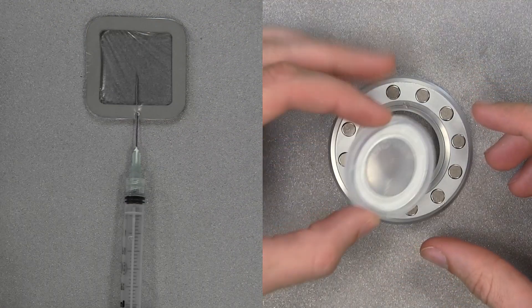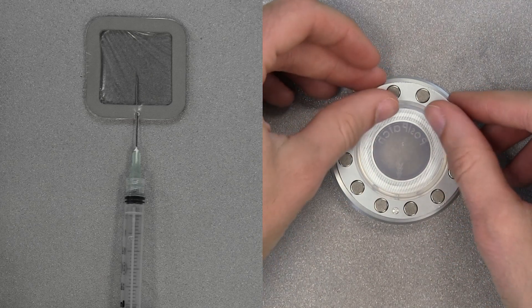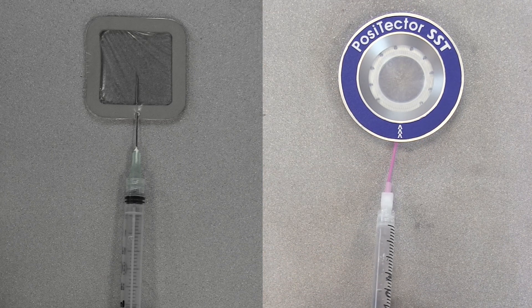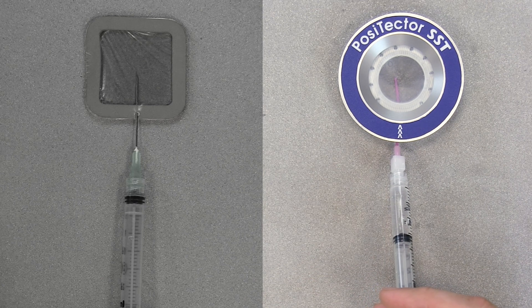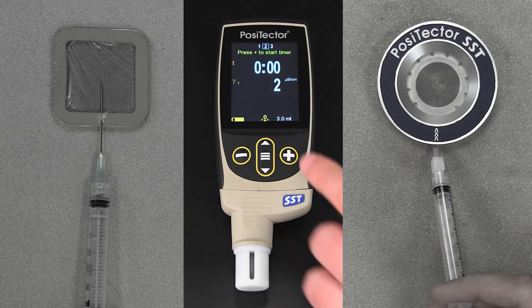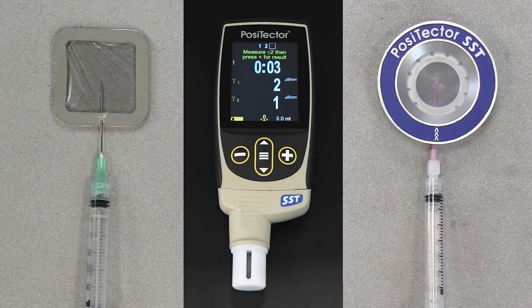If using the PosiPatch, begin by placing it into the magnetic ring, ensuring the arrows align with the injection port. Take care not to touch the interior. Place it onto the surface and inject the water into the patch using the injection port. The air within the patch automatically escapes through the air-permeable membrane. Once the water is injected into either patch, press the plus button to start the timer. Use the syringe to repeatedly inject and withdraw the water, washing the surface.